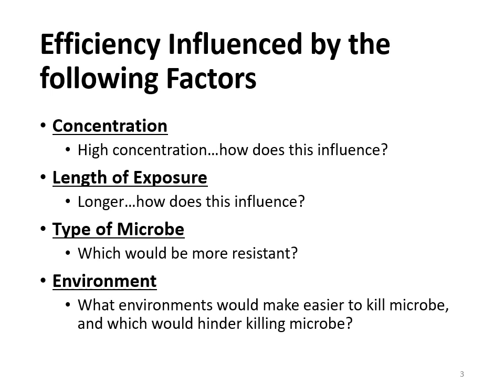When that organic matter is present, it will be harder for you to kill those microbes. Your antimicrobials will be less efficient because those microbes are now protected by all of that lovely grossness. In addition to that, those organic materials sometimes also break down certain antimicrobials. So again, organic matter such as pus, blood, vomit, urine, any of those lovely things, makes antimicrobials less efficient.